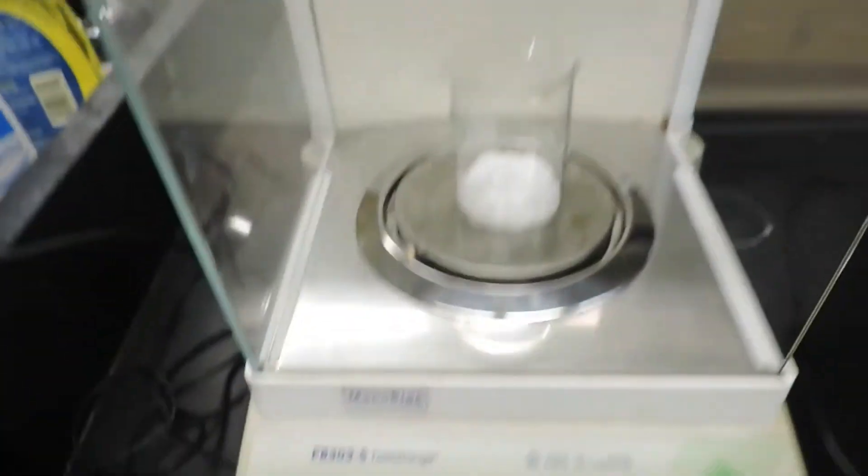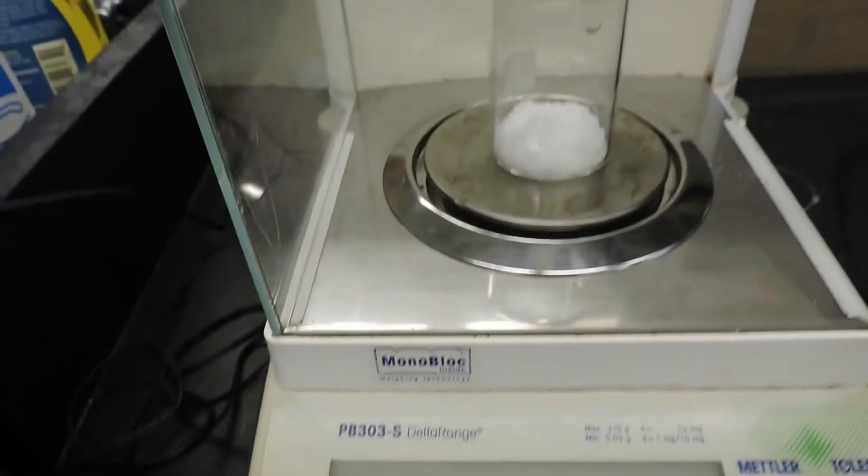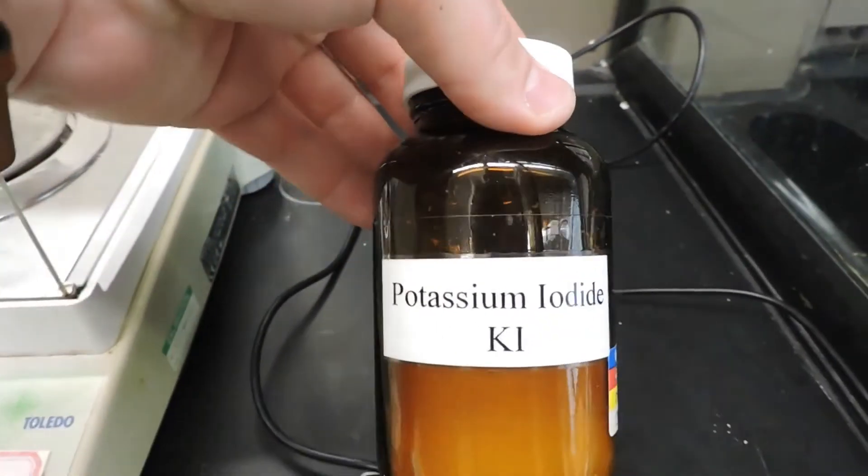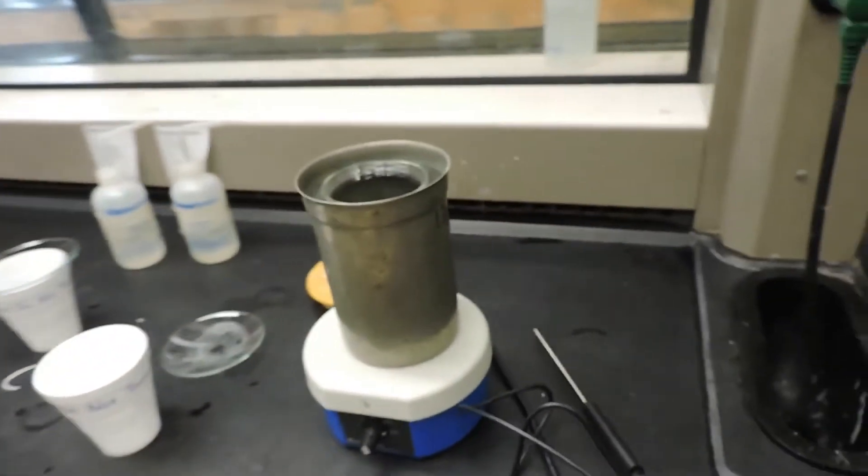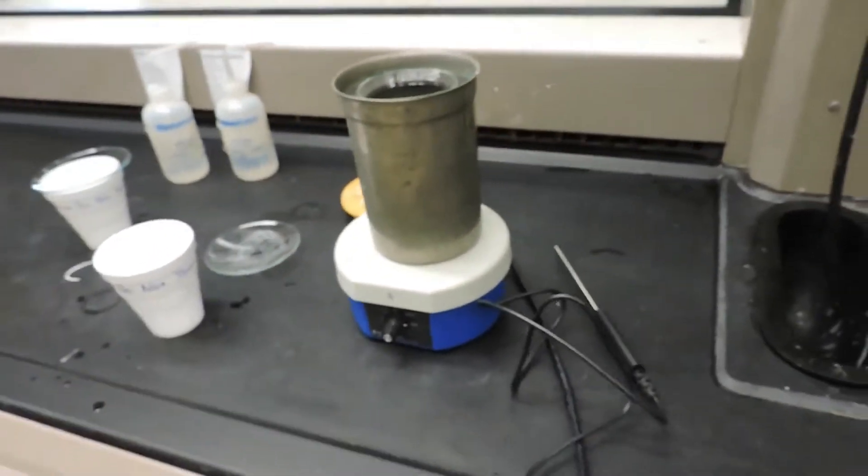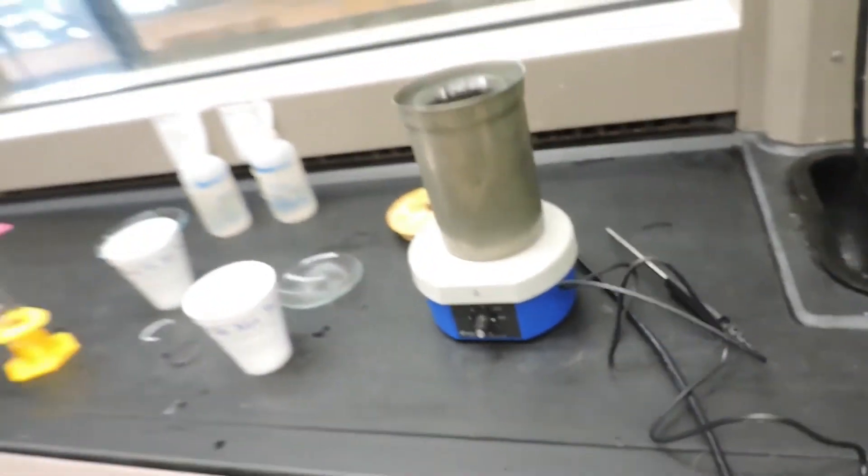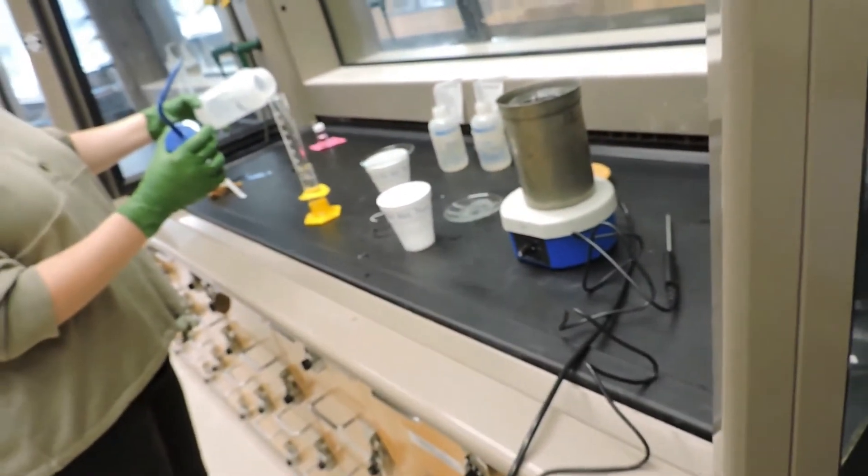And here we have weighed out 16.612 grams of potassium iodide. The calorimeter is set up for this. The calorimeter is clean and dry. And what we'll do is set the stir plate to a medium stir rate, so it's gentle and not too vigorous.